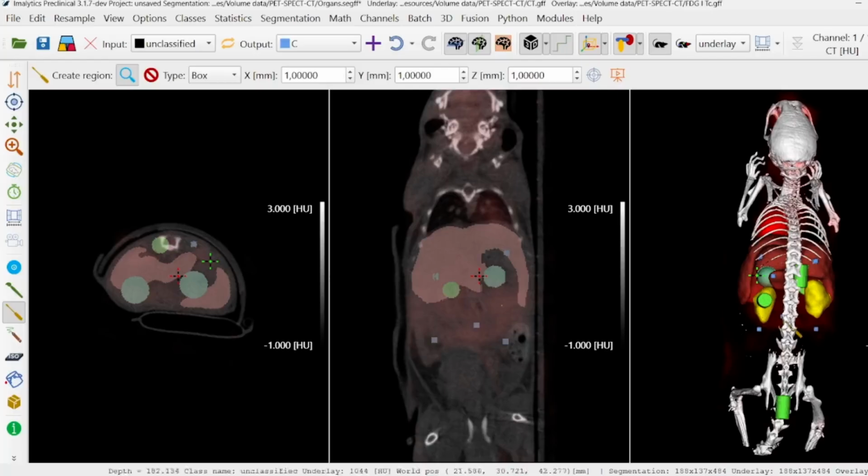3D. What is important to mention, when you use this function in 3D, it's not possible to click on the black background here. You really have to click on the defined voxel. Otherwise the function will not work.